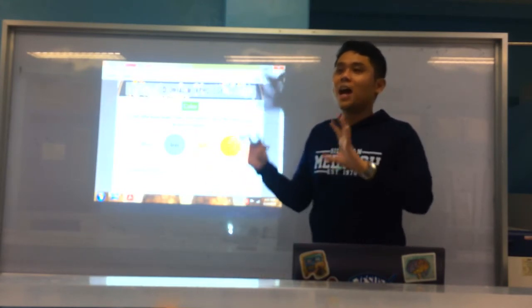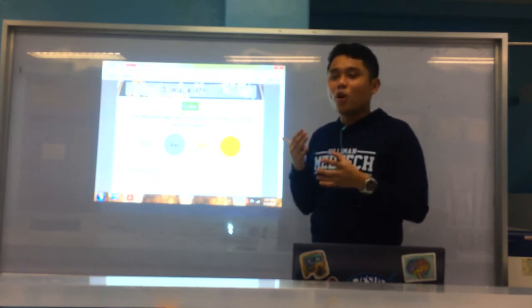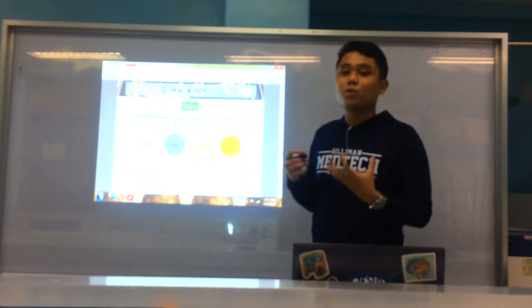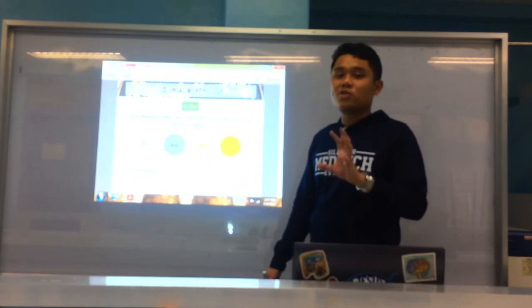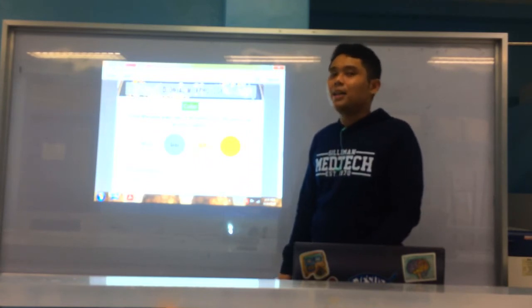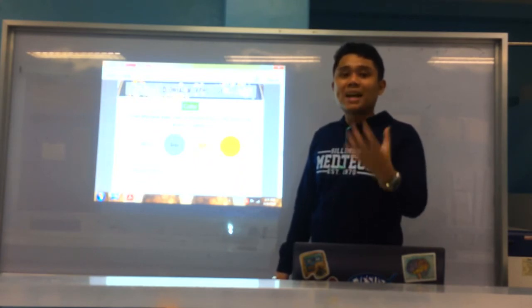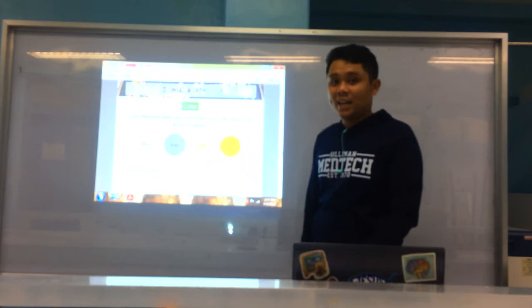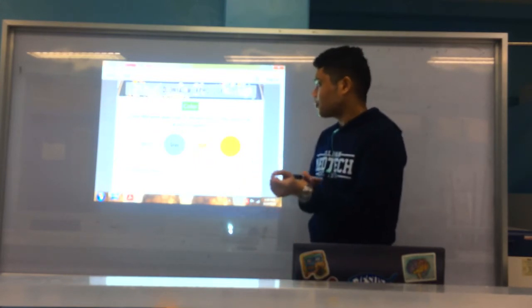Okay, please take note. If na color in non-differential media, then you can say na it's really because of the bacteria's innate ability to produce pigments or to produce color. Okay, and if in differential media naman, example MAC, XLD, it's because of their differences in their ability to metabolize, example, a sugar, and because also of the presence of pH indicators. Okay, so muna siya difference lang if sa pigmentation, okay, or color.